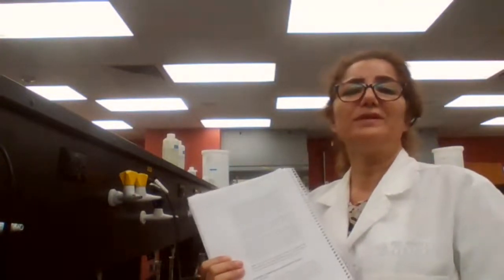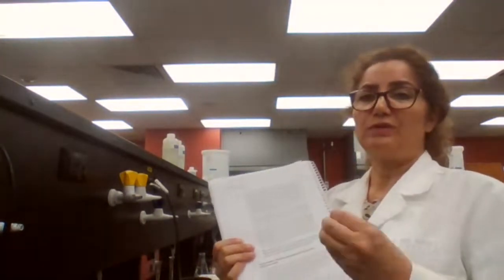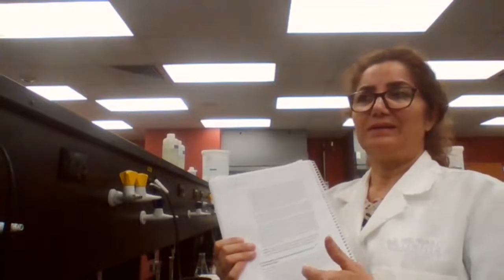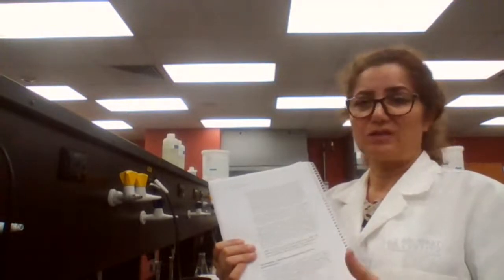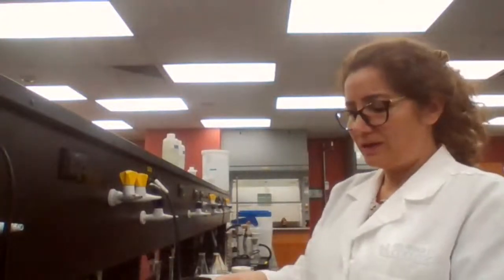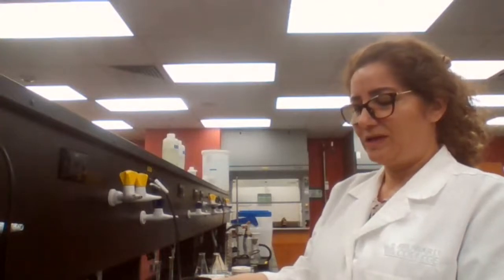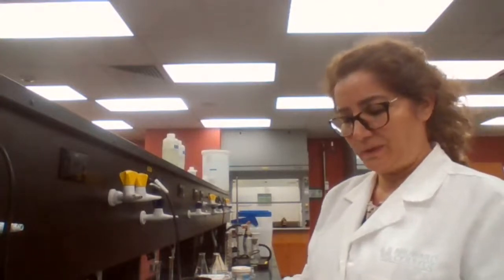Insoluble in boiling solvent, very good. So impurities should not be soluble at all. When the sample dissolves, the impurities should stay in the solid form. They don't dissolve at a high temperature. In that case, you are going to set up a hot filtration, which is a gravity filtration. You only use hot filtration if you have insoluble impurities.